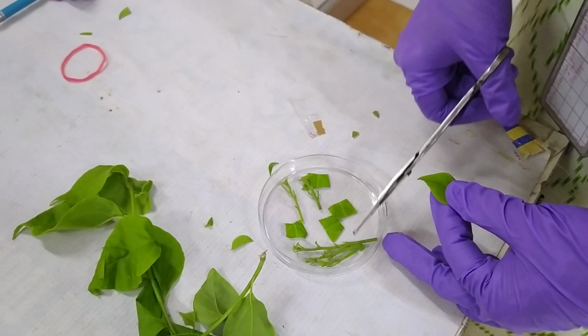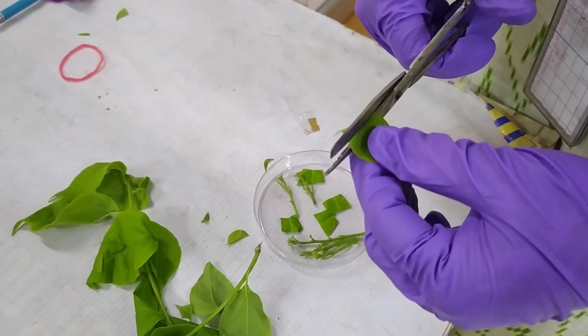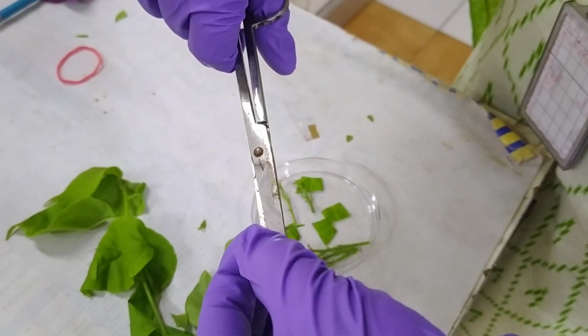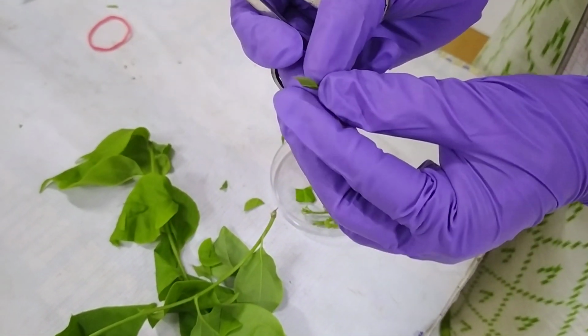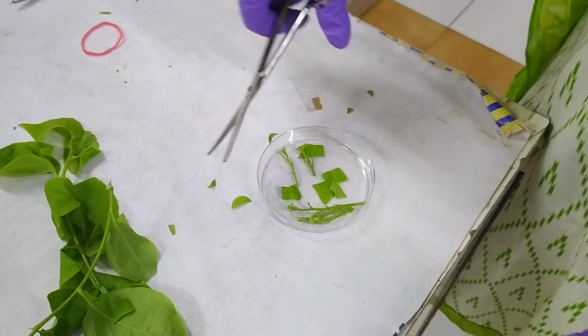For that, the callus has to be developed. The callus will develop in the damaged part. So we are just taking the leaf and creating damage so that the damaged part gets exposed to the medium, and from the parts wherever it is damaged, the callus is going to develop. This is how we will be preparing the explants.